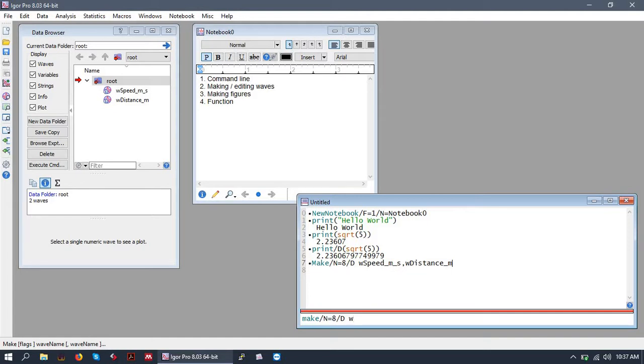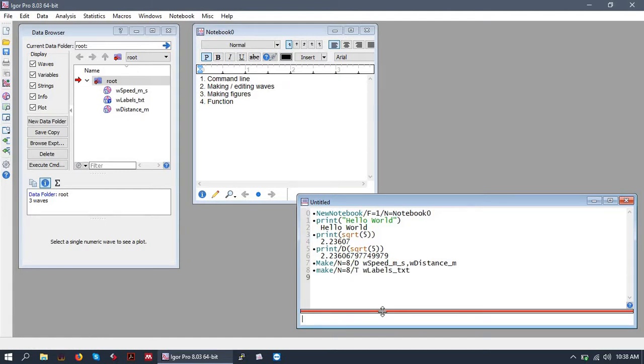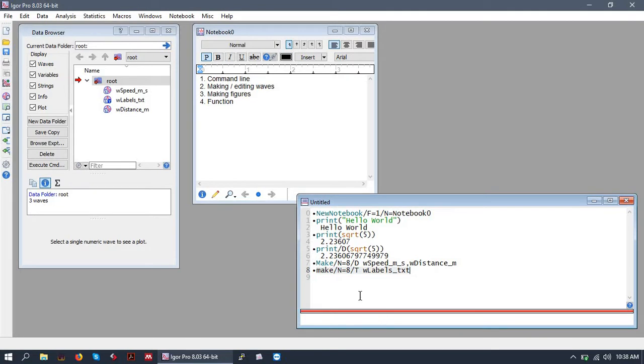Okay, let's name this wave. Let's make this a text wave. And labels. So here we just made a wave from the command prompt.